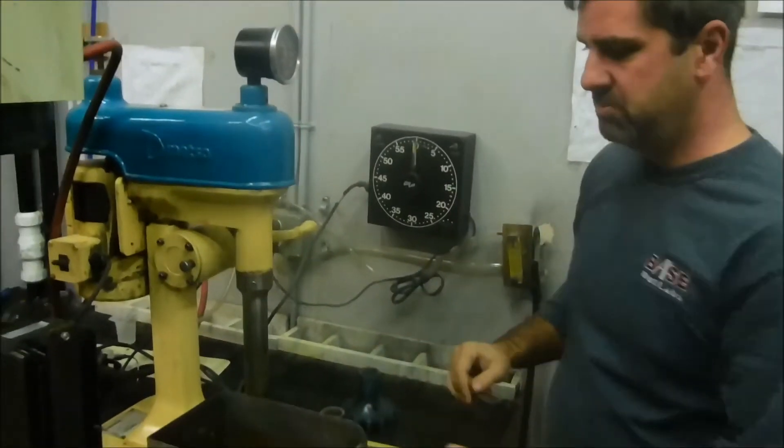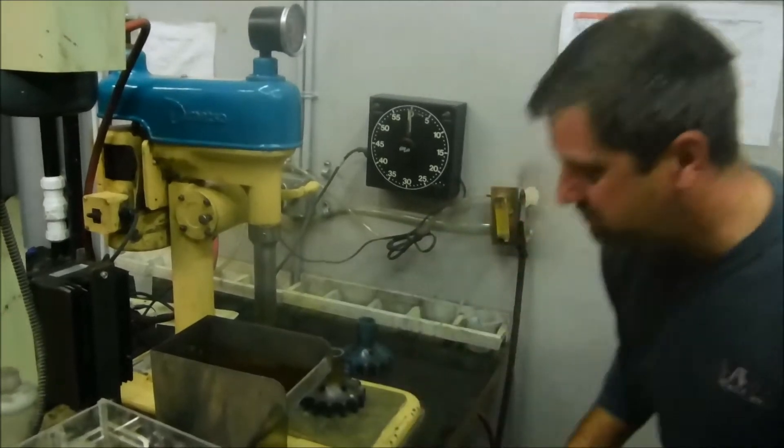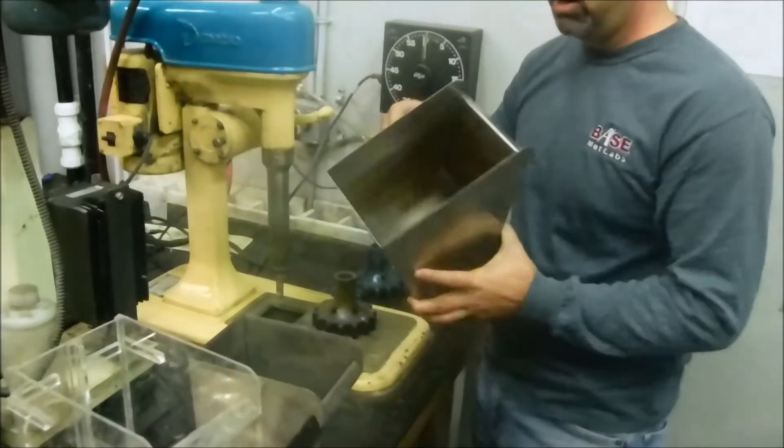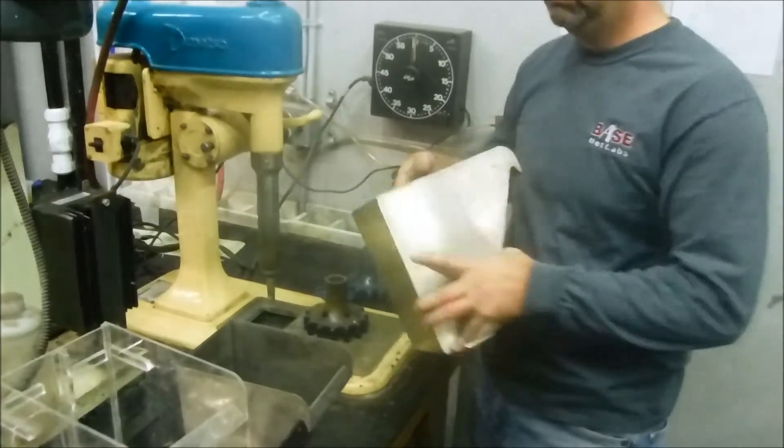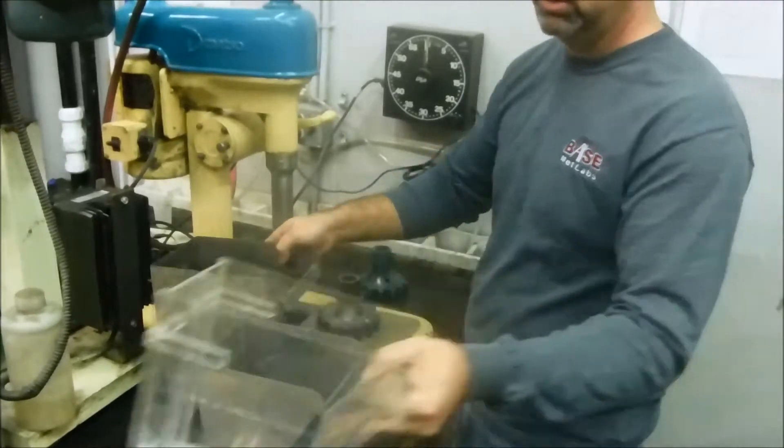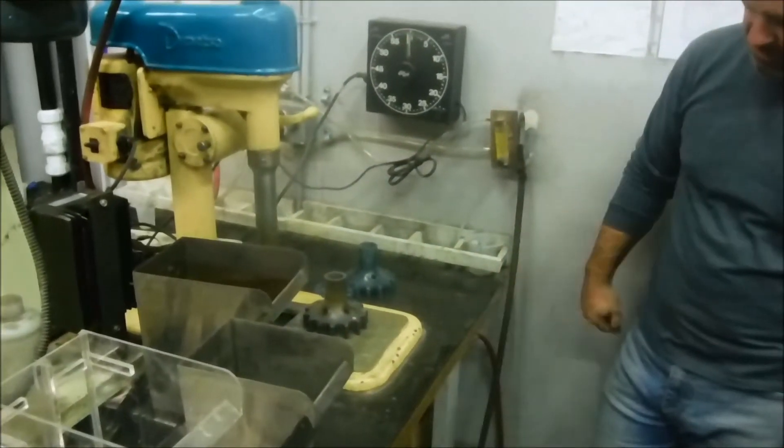Just a few things about the Metso machine. We have a number of different types of cells that we can run. Most of the cells for the Metso are stainless steel. They do come with some Perspex options and some other options for high intensity scrubbing.